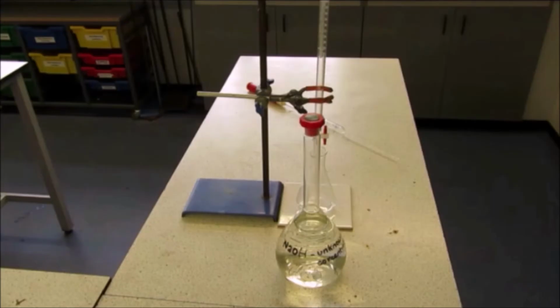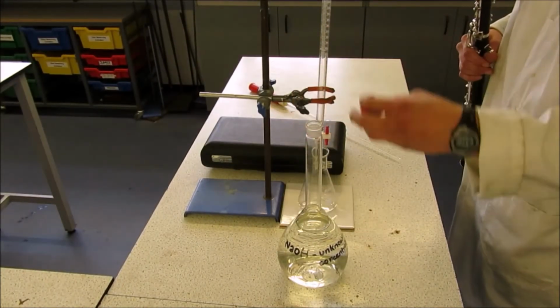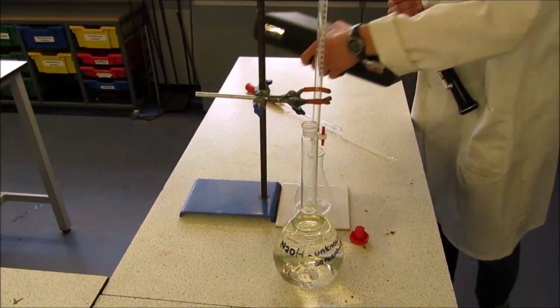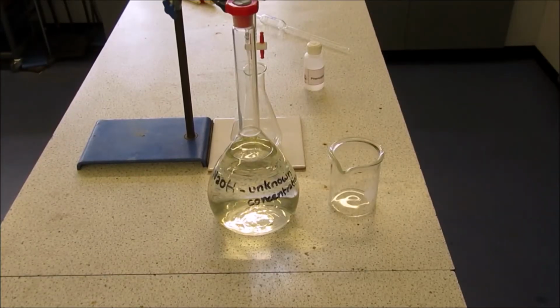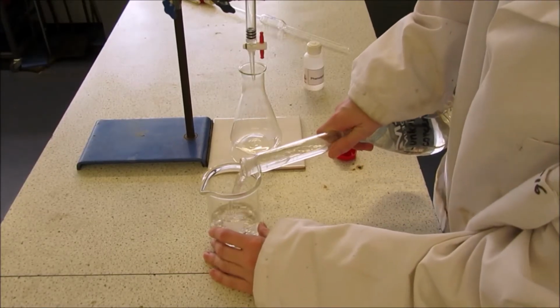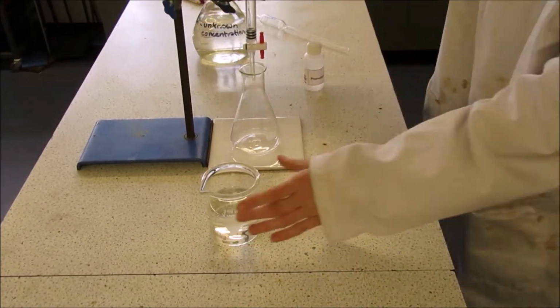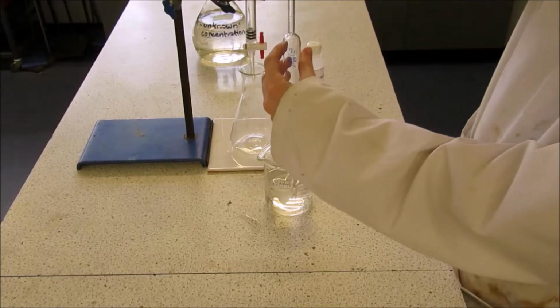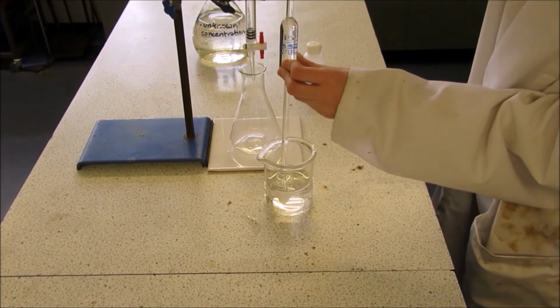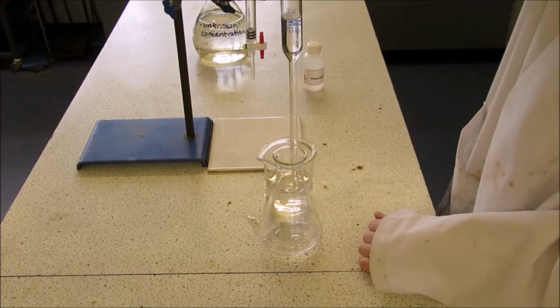Measure out 25 centimeters cubed of the NaOH solution with the correct instrument and place it in the flask. Not this kind of instrument. Although the oboe sounds nice, it is not precise enough and may become damaged. Use a volumetric pipette. You may have to pour out the solution into a beaker, as the pipette could not fit. Then place your solution in the conical flask.